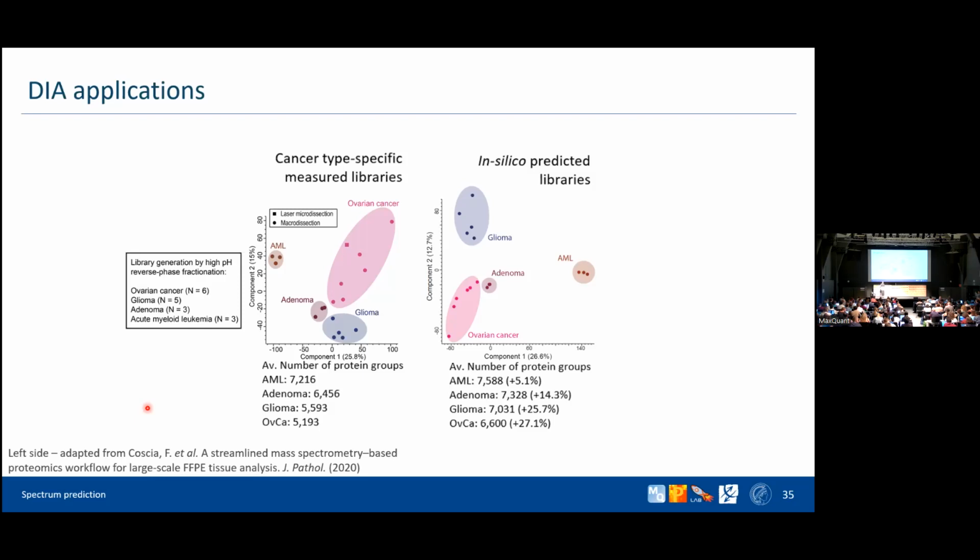Yeah, so the in silico database will be much bigger. First of all, it has all UniProt proteins, while the experimental library will only have, let's say, half of the proteins or something like this, if it's really good. But also the sequence coverage is complete in the in silico prediction, and it's 20–30% in the measured library, right? So you can say it could be around a factor of 10 larger, but the argument is not like this, that because it's larger, you get more.